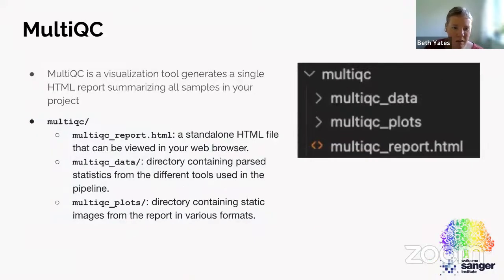MultiQC comes as standard with nf-core, I believe. It's just a visualization tool that generates a report summarizing all the samples in your project. It's not something I particularly use, and it's not relevant to the production of the genome notes, but it's something you'll see within the output directory.